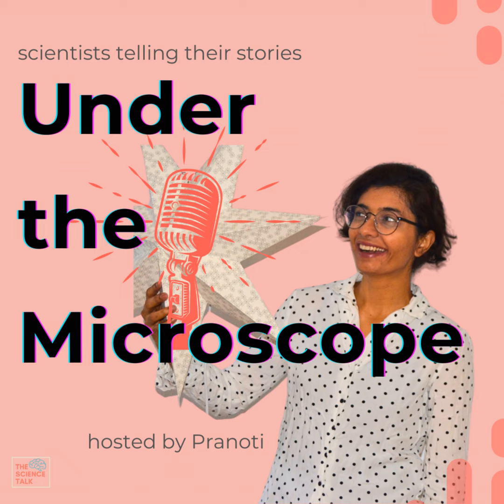And based on the skills I developed in my PhD, I got the job that I'm in now at the University of Sydney in the Australian Centre for Microscopy and Microanalysis, where I'm lucky enough to use microscopes almost every day. So now I study not only the complex metal oxides from my PhD, but through collaborations, I've come to study all sorts of different materials, like the ice I described earlier, steels and alloys, all sorts of other things.